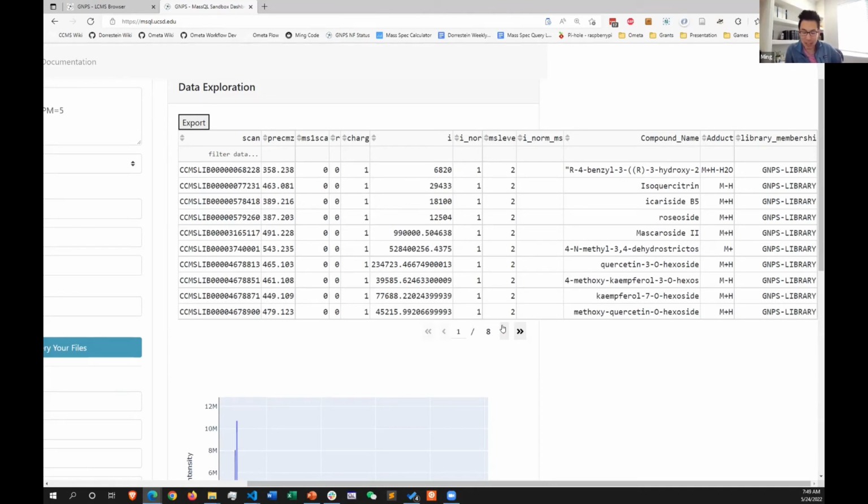And so that's an argument that automating and codifying these things makes it a lot more thorough, and finds what you were actually looking for instead of giving up a little bit earlier from fatigue. And so I think it's kind of cool. If you want to use it, definitely let us know.